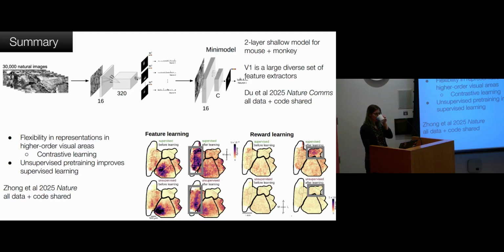Thank you. Just kind of a practical one on data analysis with Suite2p. For some larger fields of view, I've done like 1024 by 1024 or higher resolution images, and I found those are kind of hard to run through Suite2p. For your larger scans, do you guys break it up into smaller, like 512 by 512 sections, or do you find it does well with certain settings on larger fields of view?